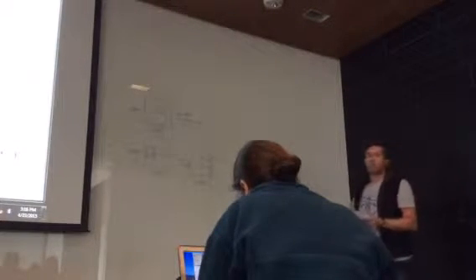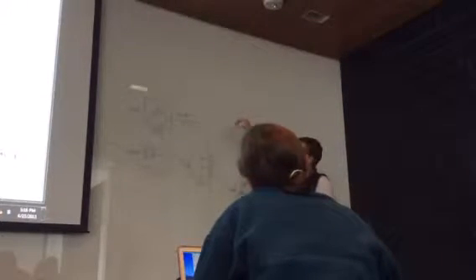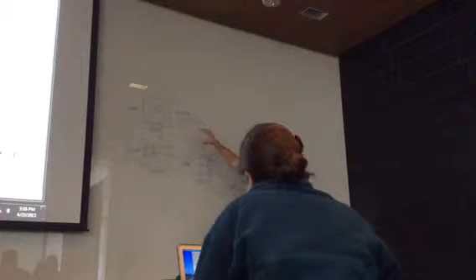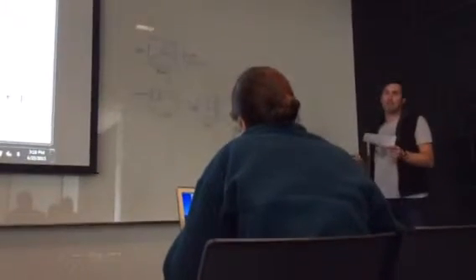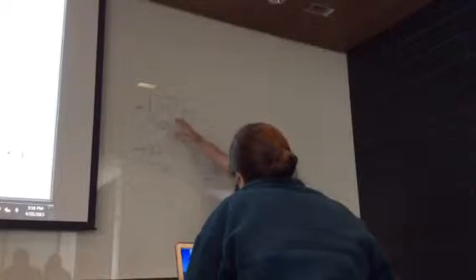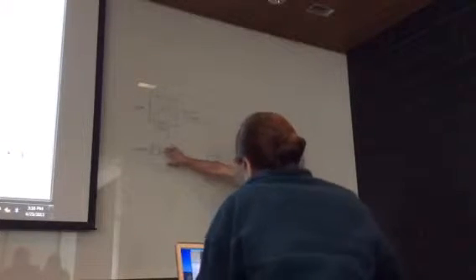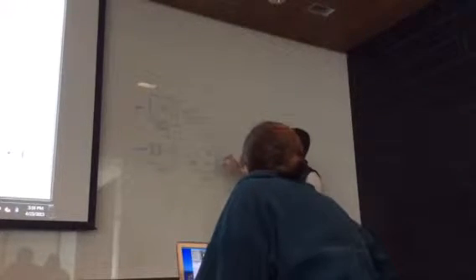Now, could you have done this in any other way? So the answer is yes. You don't necessarily have to do it in this order, but you do have to be consistent in whichever order you're actually going to do it in. The reason why we do it in this order is because what we gate on first are the things that are common between them, and then split off from it. So 45 and Lin are common, 34 is common to them, but then we use CD38 to distinguish between the committed progenitors and the more immature cell types, which are down here.